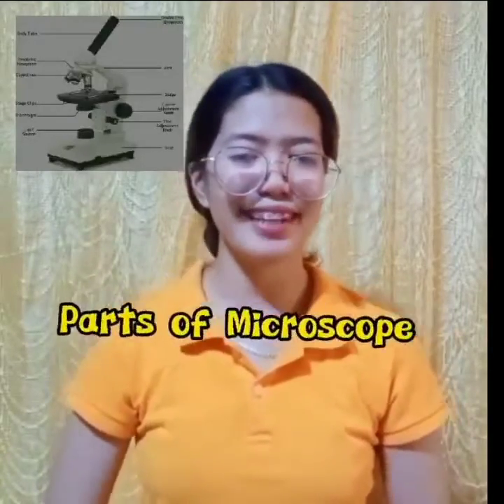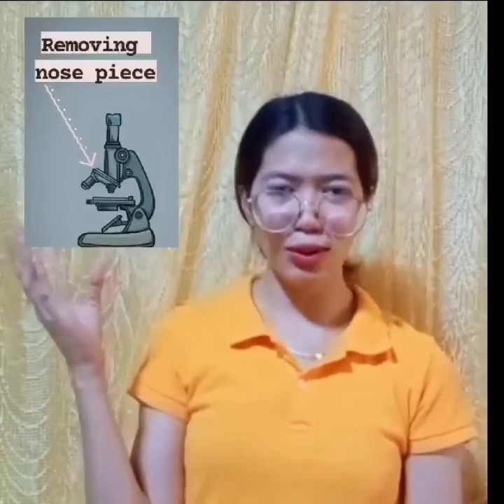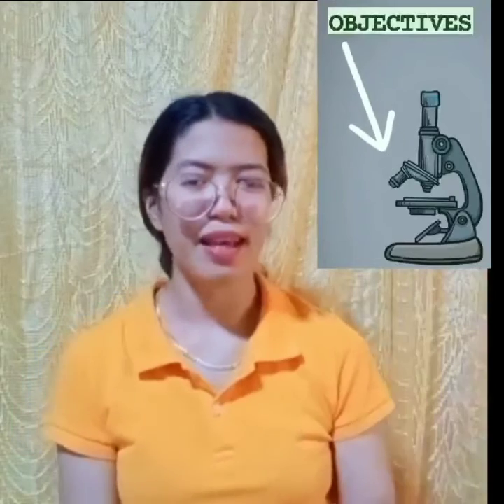So let me start with the ocular or eyepiece, which is the lens closest to our eyes, and it magnifies an image. Usually, it has a magnification of 5 times, 10 times, and 12.5 times. Next is the body tube, the one that holds the ocular in place. Next is the nosepiece, the one that holds the objectives with different lenses. And next, objective. Each lens set attached in the nosepiece is called an objective lens.